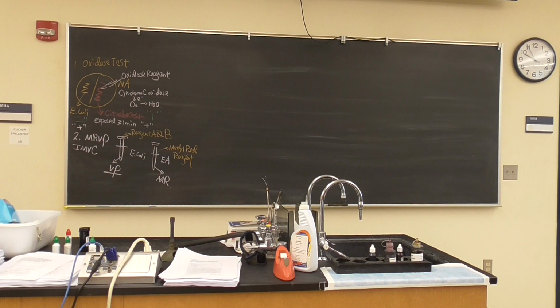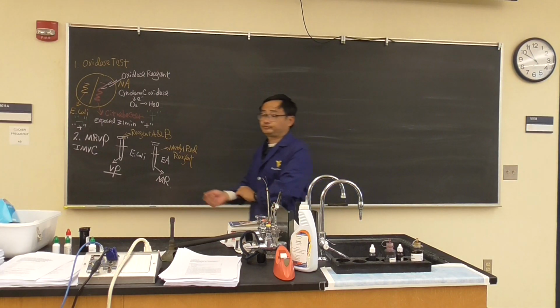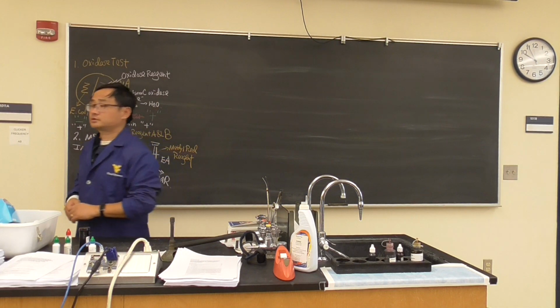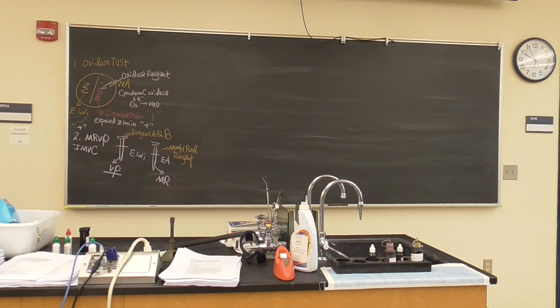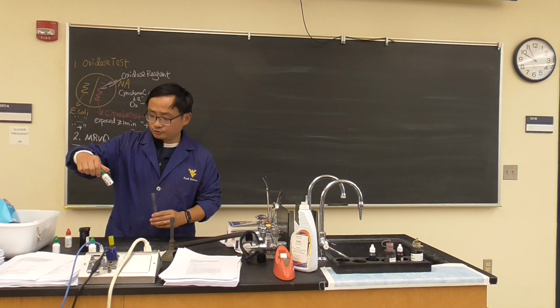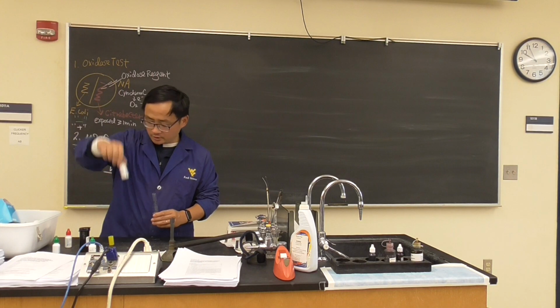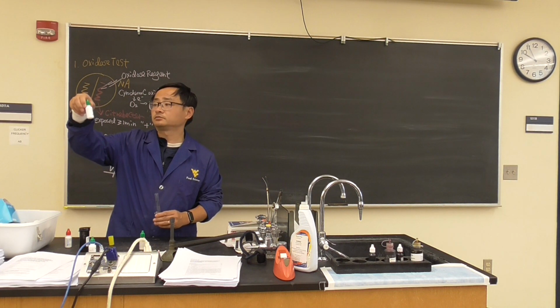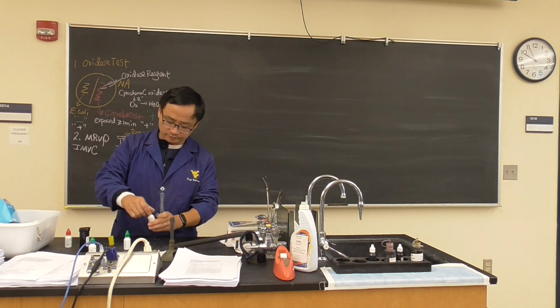Who has VP? Oh, sorry, who has VP of E. coli? Yes? Okay, VP E. coli reagent. You have it? Okay, then we're going to do it. We add VP reagent A and reagent B. Let's see what it looks like. So we have VP reagent A, and this is VP reagent B. Okay, so we're going to add it.